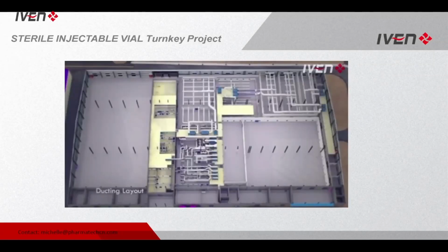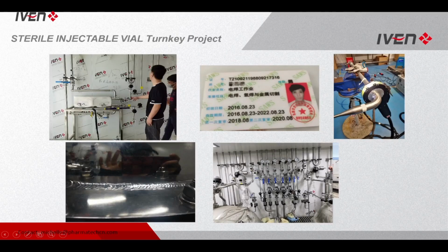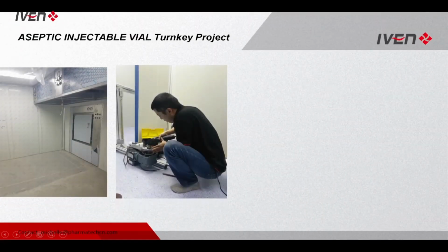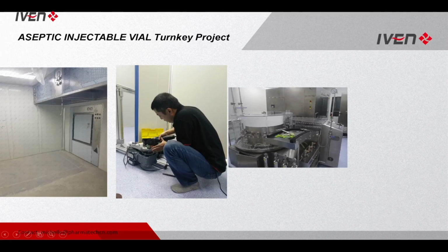After that, at the same time, we also start the installation and welding of the process pipeline. For the welding, all of our welders must have a certificate. We also have an automatic welding machine to weld the process pipeline. You can see the welding surface here is very beautiful, like fish skin, right? And here are some photos I would like to share with you from our project installations.